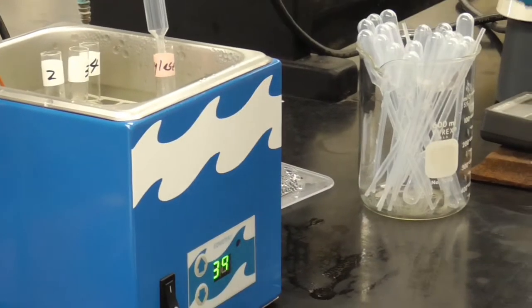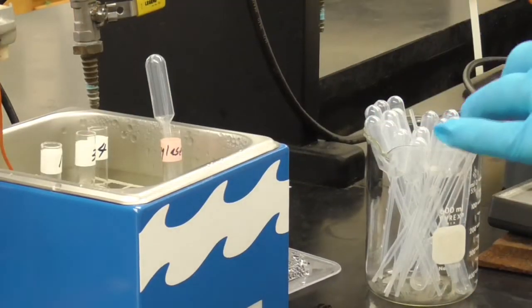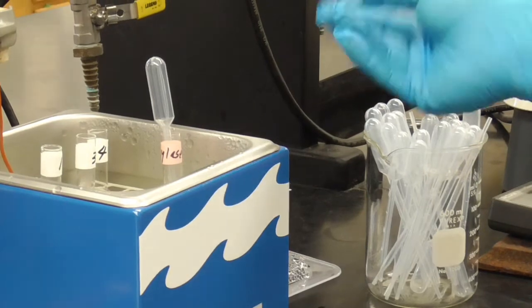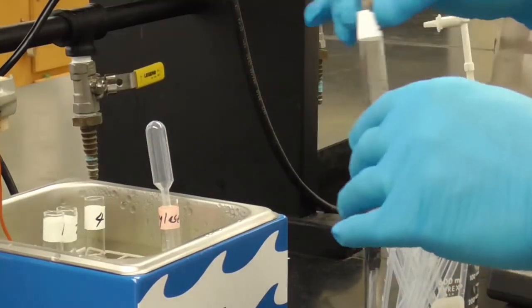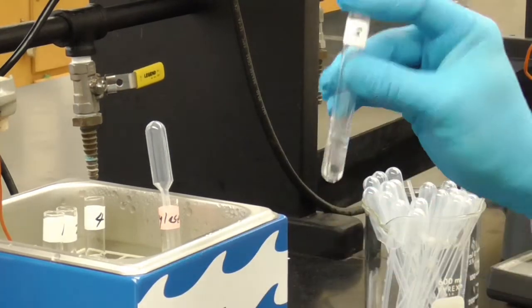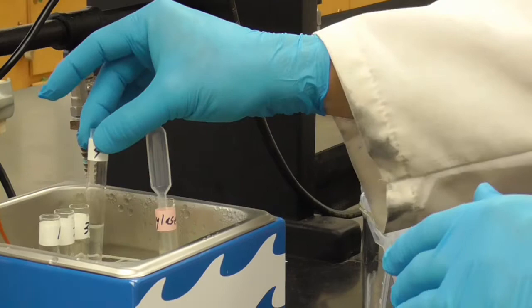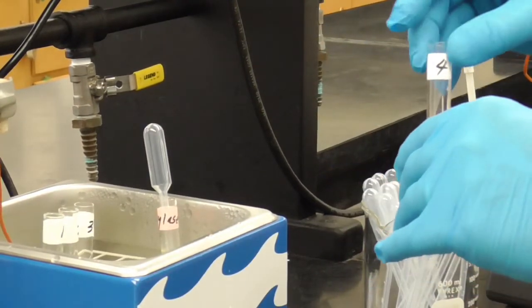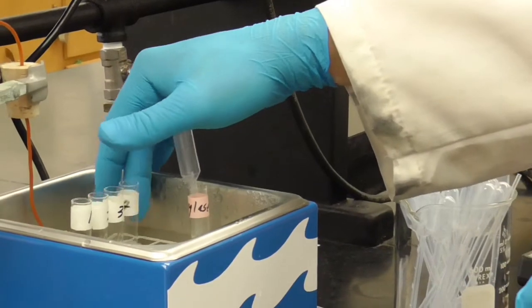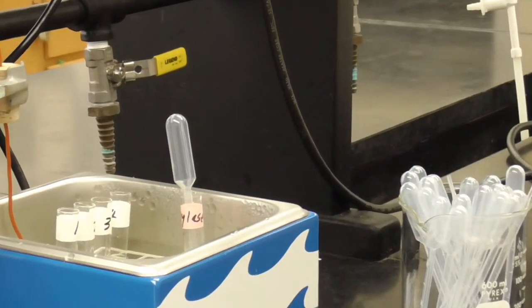So we mix it together. I'm just kind of wiping my finger off. This is probably not the best lab technique around, but I think we'll get just fine results. Also, because I'm going from the lowest to the highest concentration, if there is any little bit remaining on my finger, I'm actually not adding it.